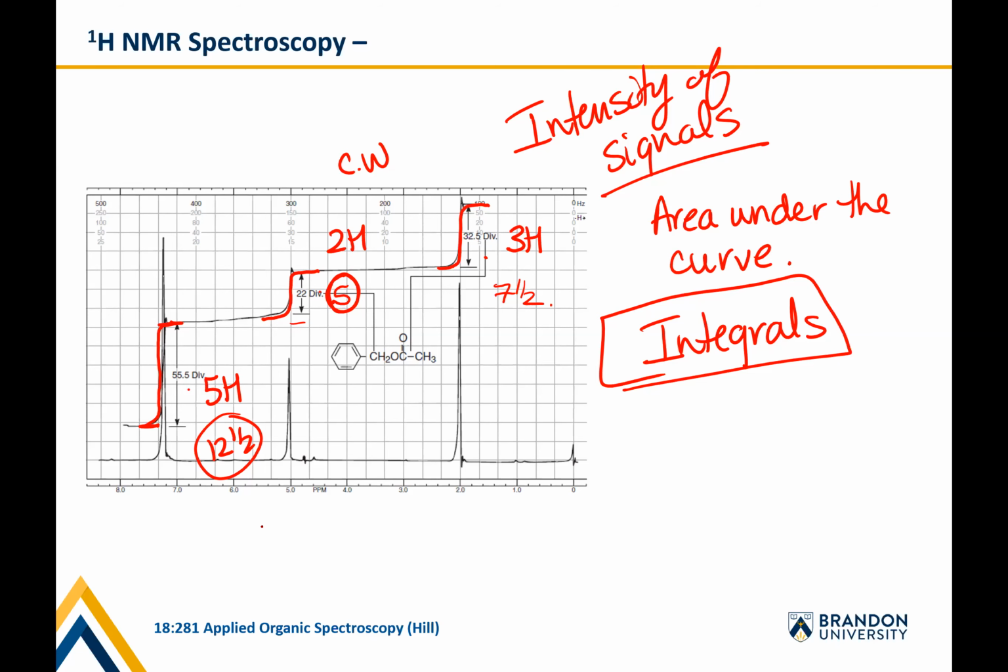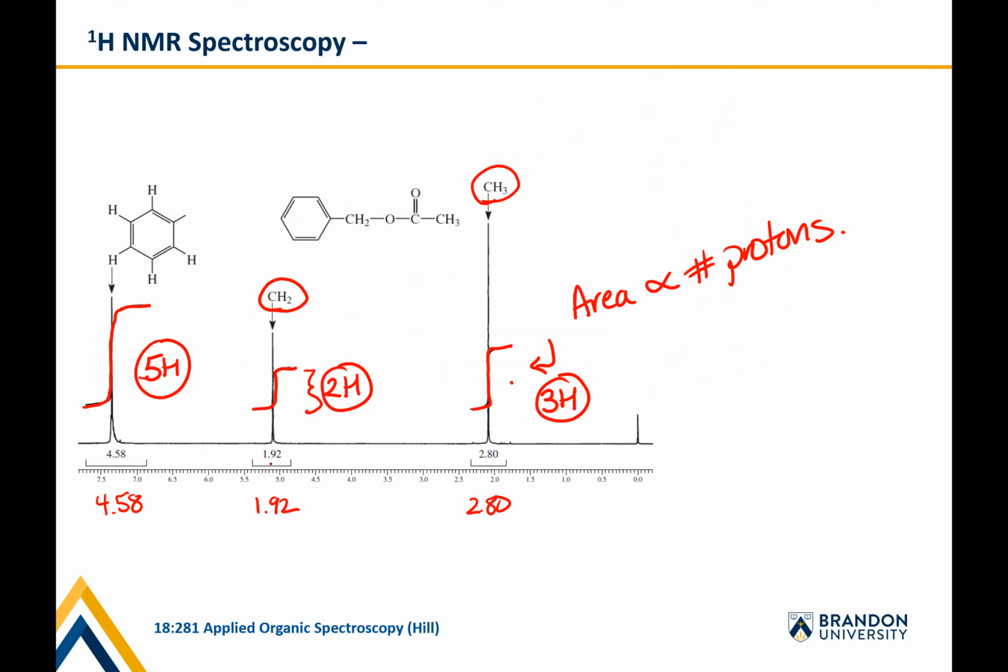So what you could do is divide this by 192, so 280 divided by 192, and then multiply by 2, which will give you basically 3.